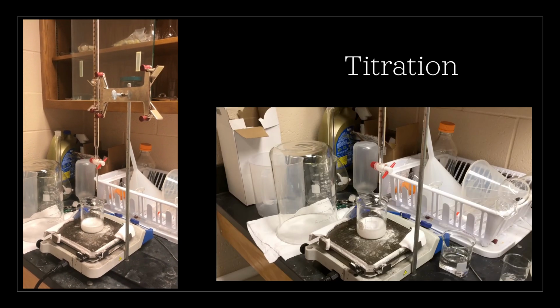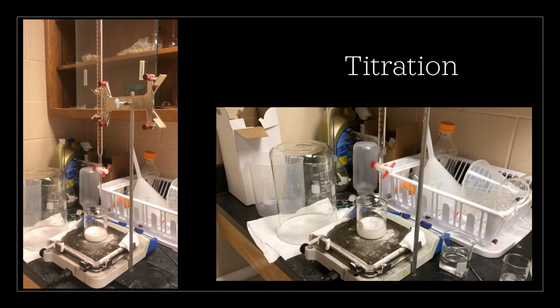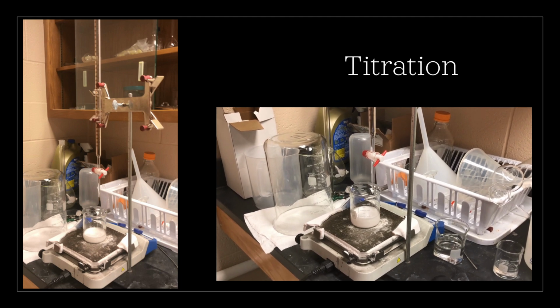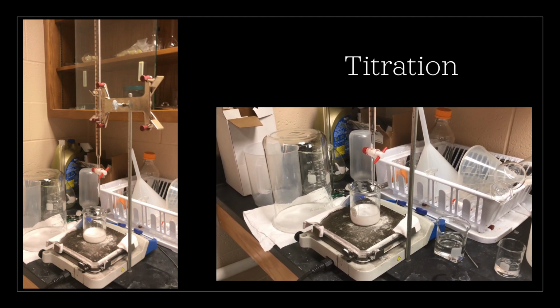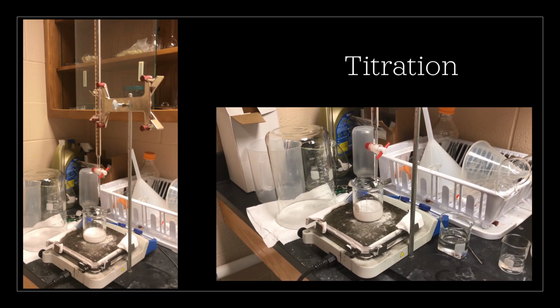Here are some instructions on titration. Titration is used in this experiment to determine the propionic acid concentration in a sample. This involves the slow addition of 0.1 molar sodium hydroxide to a sample of a known volume but unknown acid concentration.